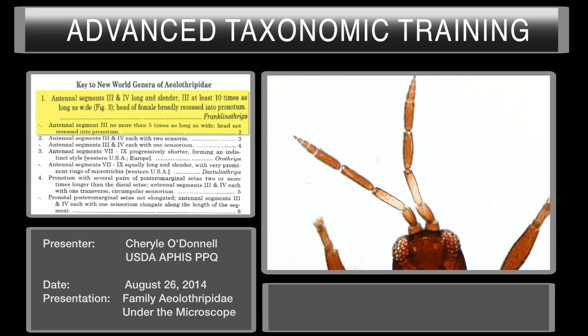On couplet number one of this key, it asks you again for the length of segment number three. In this case the length is not ten times the width. The second part of that couplet specifies antennal segment three no more than five times as long as wide. You can see here that segment three is much shorter than the specimen we saw in the last training session.